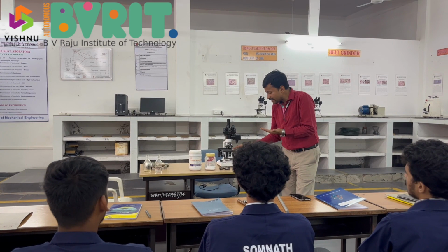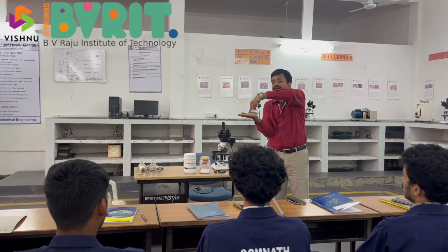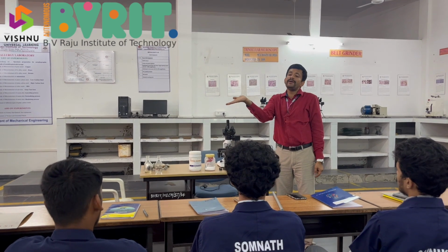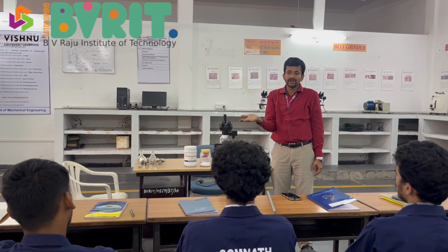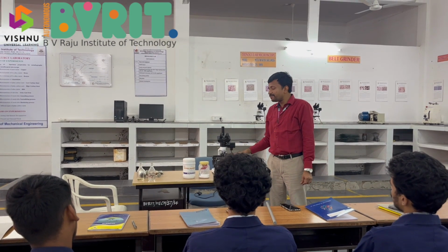So if I keep a specimen which is flat, obviously light will fall and you can see that reflection back through the eyepiece. Suppose I keep it a little tilted, what will happen? Light will pass somewhere else, reflect somewhere else. You can't see its image clearly, right? So there are certain rules that you need to follow before keeping it on the microscope.